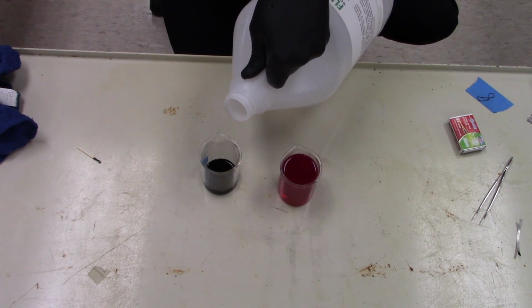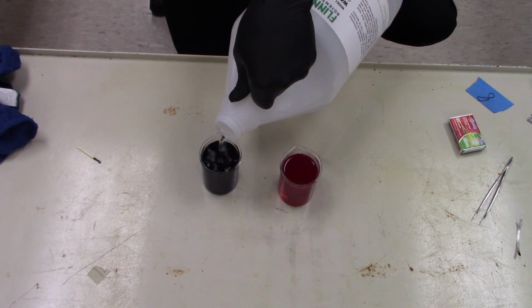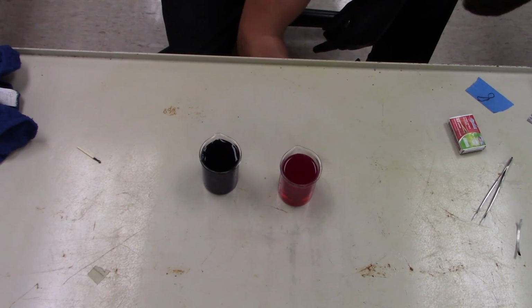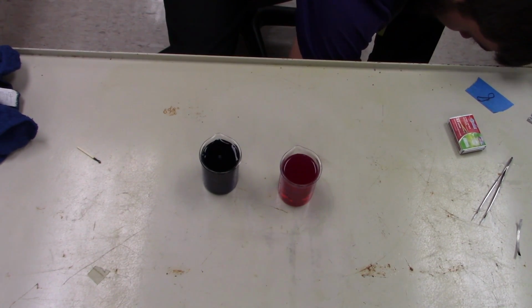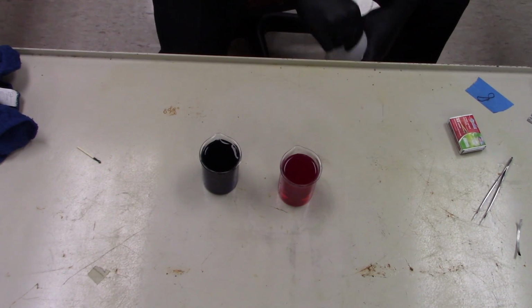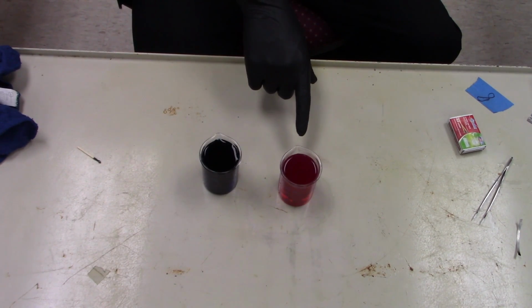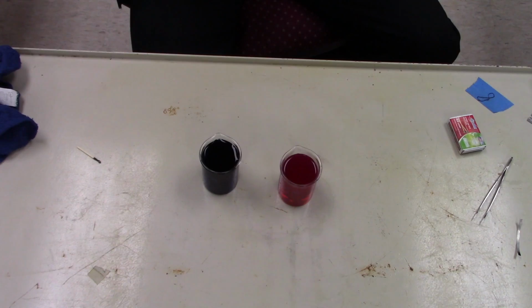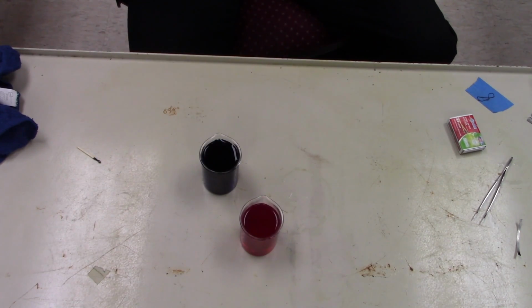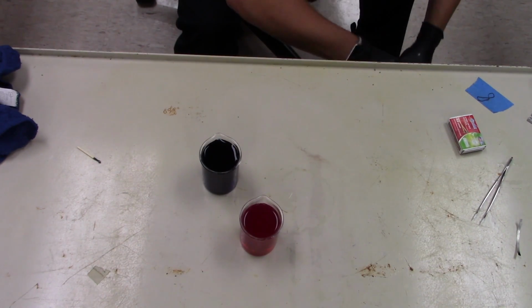Now this one, hopefully, doesn't do anything. Okay, good. I just want to dilute it a tiny bit. So I was going to add something to that to make it change color, but it decided to do it for us. And that's okay. What I can do now is alter this and make it go back. So it's basic. If I add some acid to it, I should be able to make the color disappear again. So we'll put it in front so everyone can see. It should go back to, oops, that's the wrong material. It should go back to clear.